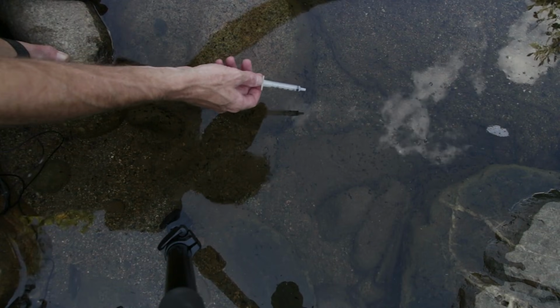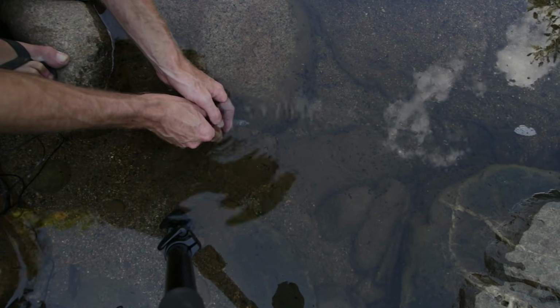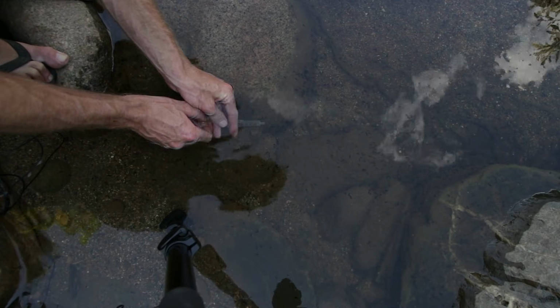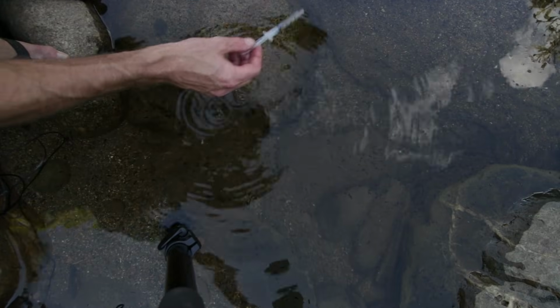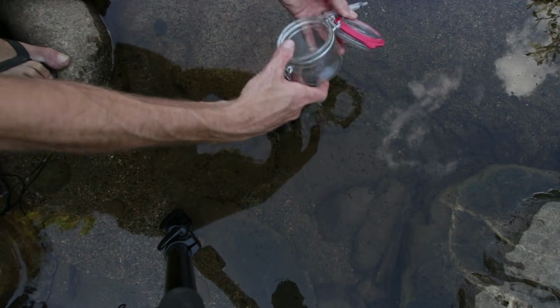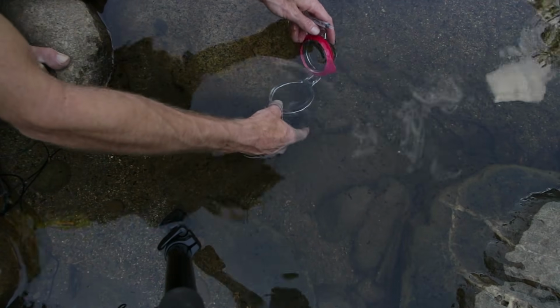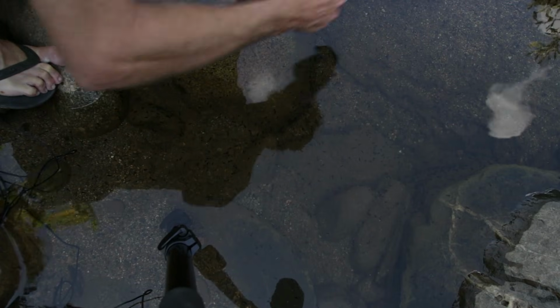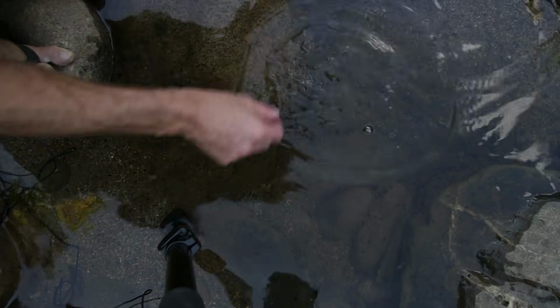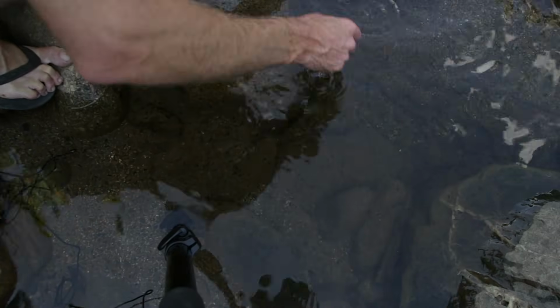I've got here a little syringe just to suck stuff up from the very bottom. So let's get in there and suck some of that green stuff up. And I might even try and get a couple of little tadpoles if we can. Yeah, just one will do. Scrape some slime off as well and get a hole. Let's just use our fingers, why not? Get in there, a bit of dirt.